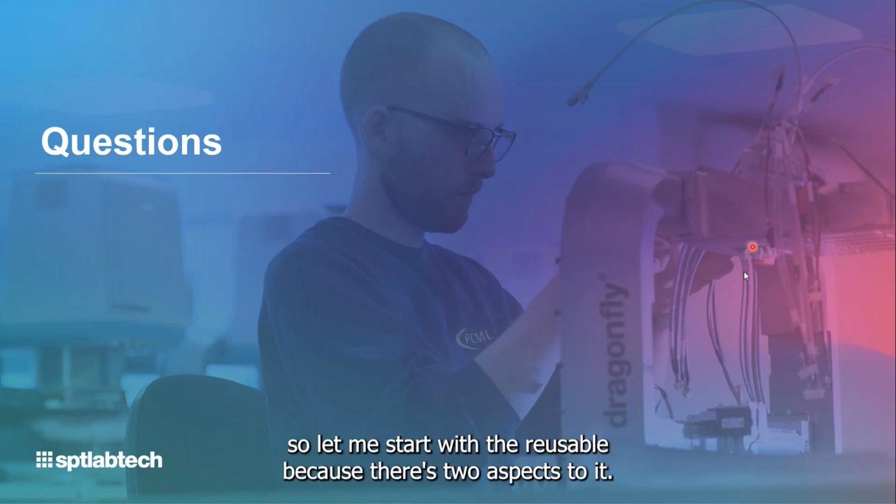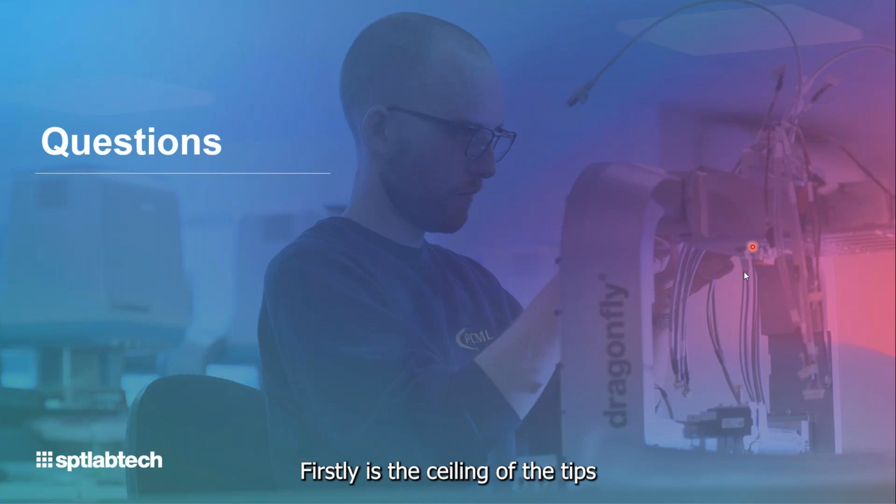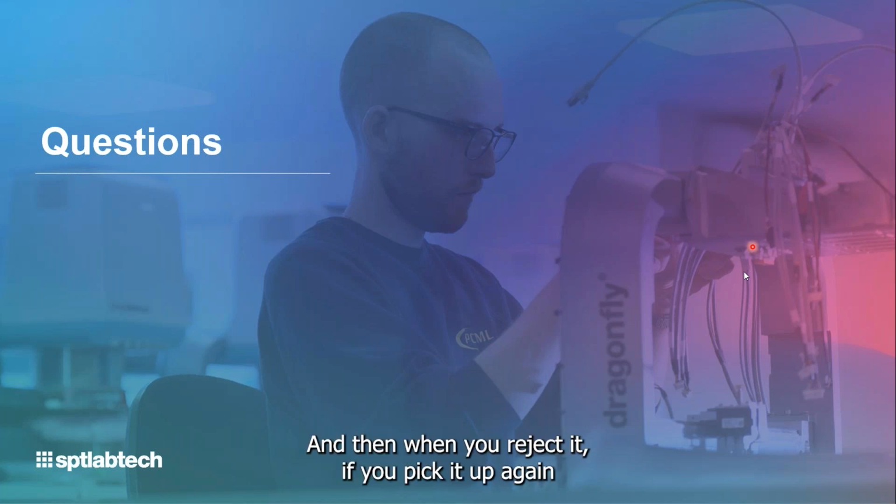I'll take that one. Let me start with the reusable, because there's two aspects to it. Firstly is the sealing of the tips, because most liquid handling systems use a kind of forced-on tip, a deformation seal where the tip mandrel is forced into a tip, and when you eject it and pick it up again, each time you put in force, that does tend to wear the tip and cause issues over time.